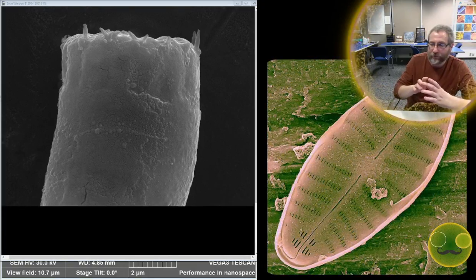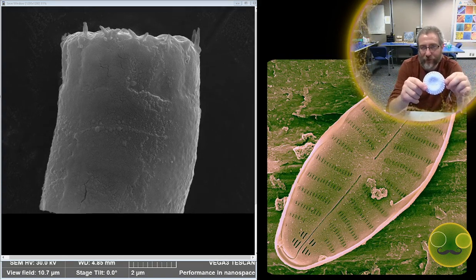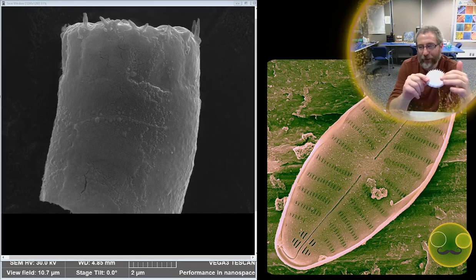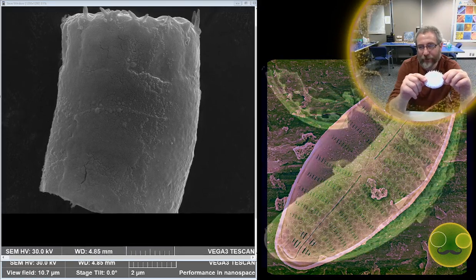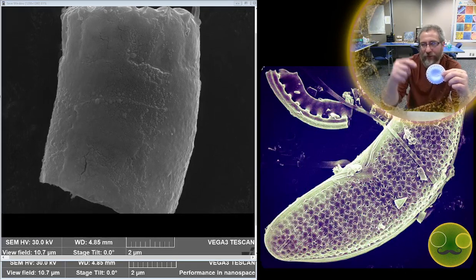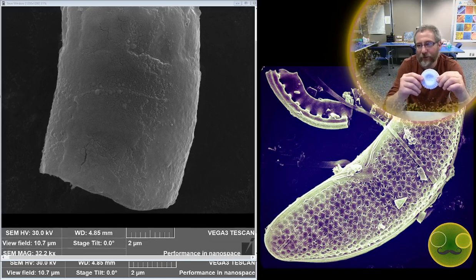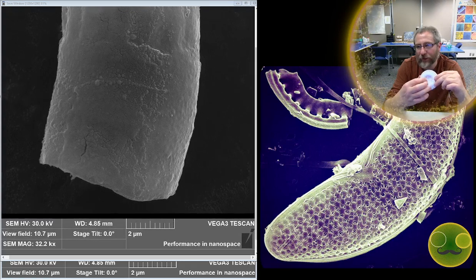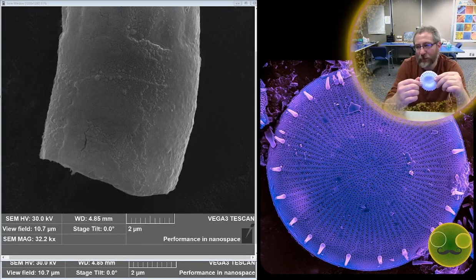If you had a surface and you were pointing it towards your face, like right now, if I get the light just right, it's coming off at a perfect angle that this whole surface is very bright, because it's pointed directly at the camera. And if you tilt it just a little bit, it gets darker, and then you can see more of the actual structure, because now the light's only hitting the top part rather than the whole face. So the light and dark features that you can see, like the depression in the middle of the valve or the little ridges that are present when I tilt it, that's what the SEM is doing.